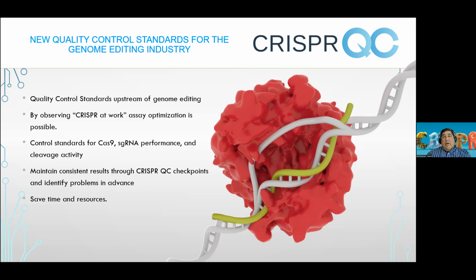A cleave assay takes me about 4.5 to 5 hours, and we can usually run anywhere from 4 to 8 of those on a single system. I did not mention that the system is fully automated. It's a liquid handling system to which our hardware has been fully integrated, and we have these programmed assays. So there's minimal human error intervention other than the initial preparation of the samples, and we're working on actually having the robot do that as well.